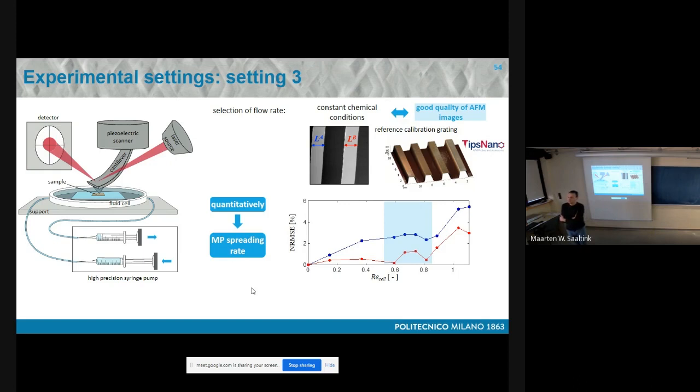Instead, by trying to blend two different phenomena in one stochastic model, it fits the data very beautifully. It's very spectacular, and it is very nice for other things. Not for permeability. This is another discussion that we had another day. Isn't it too complex for something that you could describe in terms of, say, okay, I have two sets of phenomena, and then I separate one process in areas where it is flat, one process in areas where you have this.